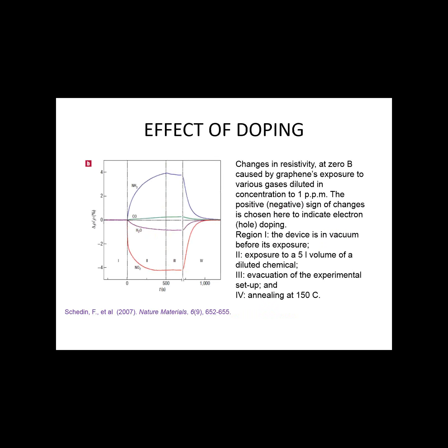The other reason why we would want to study graphene, charge transfer in graphene, is things like doping, which means if you put any gases or other materials down on graphene, there's usually a charge transfer between the foreign material and the graphene, which basically means that the resistance of graphene depends dramatically on its sensitivity to the environment.